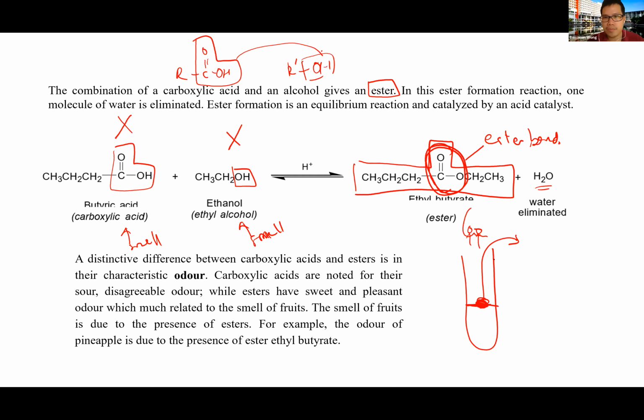Another reason you do not smell directly is that there may be some unreacted carboxylic acid or alcohol, which may interfere with the smell. So you take it out and smell it separately.